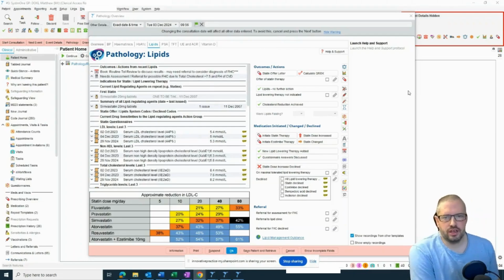Hi there. This video is about how you use our pathology system, and particularly the template, to review individual patients with their lipid results and record outcomes. The idea of the system is that we minimize the amount of patient contact that's needed to manage those lipids. Often patients will be sent information or questionnaires, but there are some outcomes that need an appointment, some conversation, or some kind of notes review.